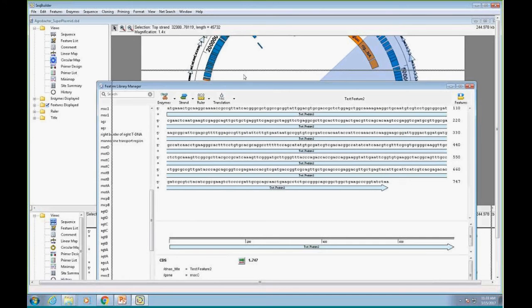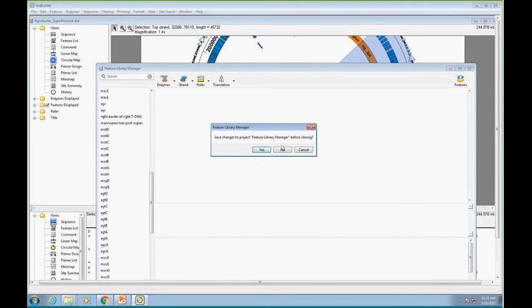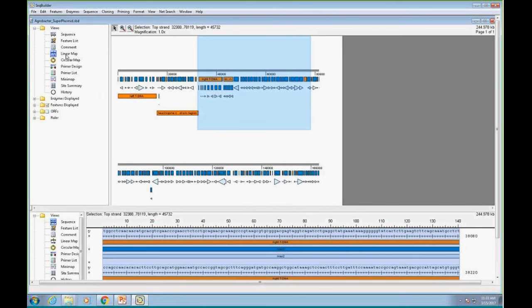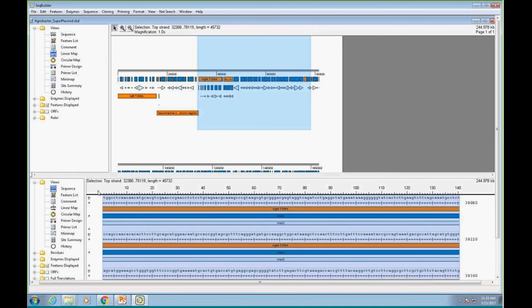Yeah, there are different mechanisms to change the views, and we do have some other webinars that show how to do that. But using these views on the side, I can go through and create different types of maps. These selections on the left control what you see on the right. I can also create additional splits in the window.